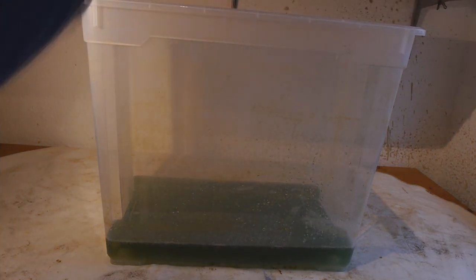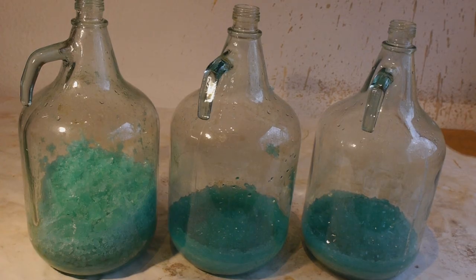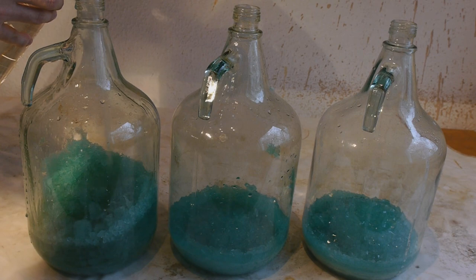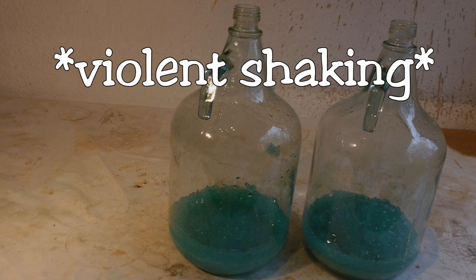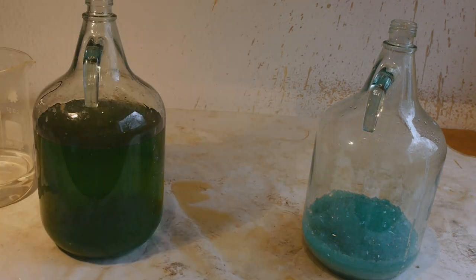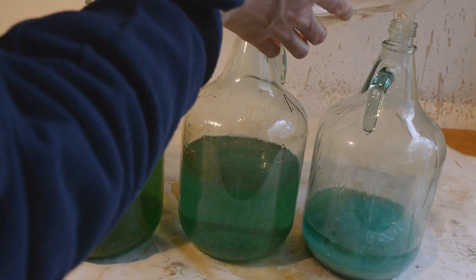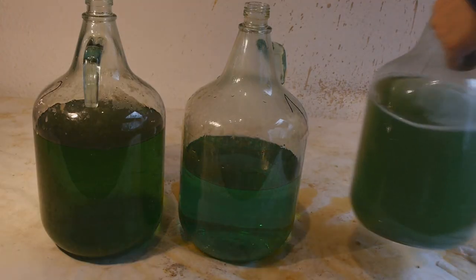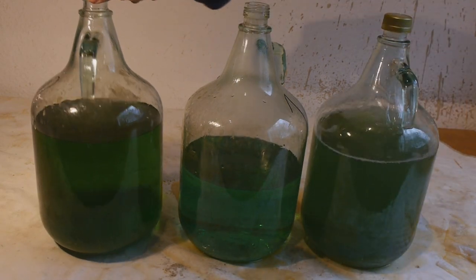Oops. Now we need to get all of these crystals to dissolve, and we're going to do that by adding some hot water to these bottles. Alright, that was an entire workout to get all this in solution.